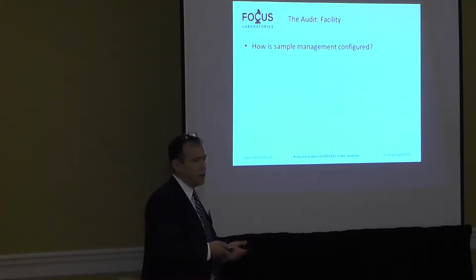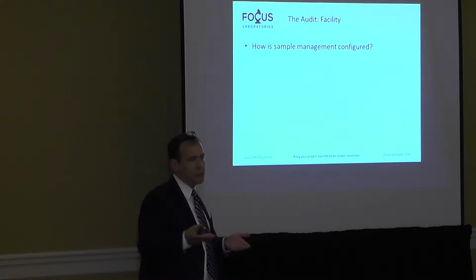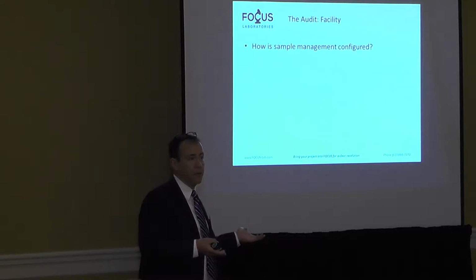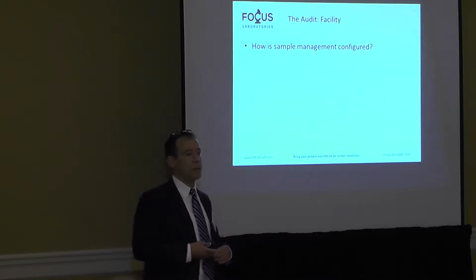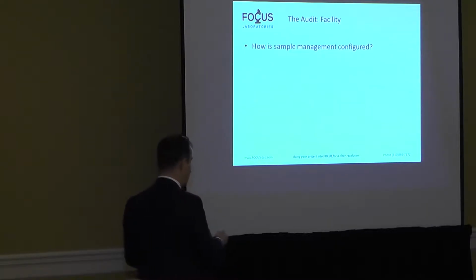Okay, so you're in the facility, you're looking around. How is sample management configured? That's the first step. Of course, you're going to walk the walk. What does your sample do as it goes through the laboratory? Your sample's mixed in with hundreds of other samples. Hopefully they're protecting your confidentiality. You can't see what those samples are, but you have a sense that there's good segregation, so there's no mix-up. They're comparing your chain of custody, your sample submission form, to the information on the label. There's a nice, neat process for doing that.